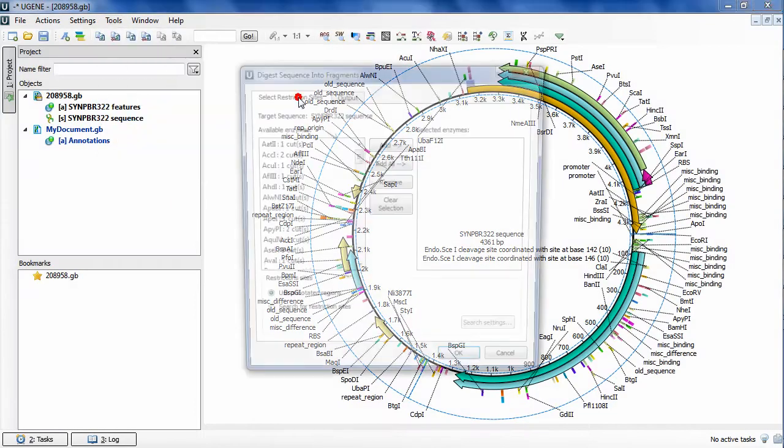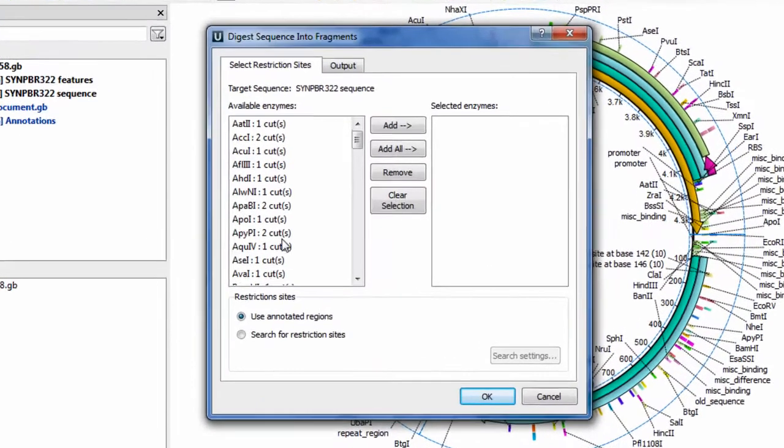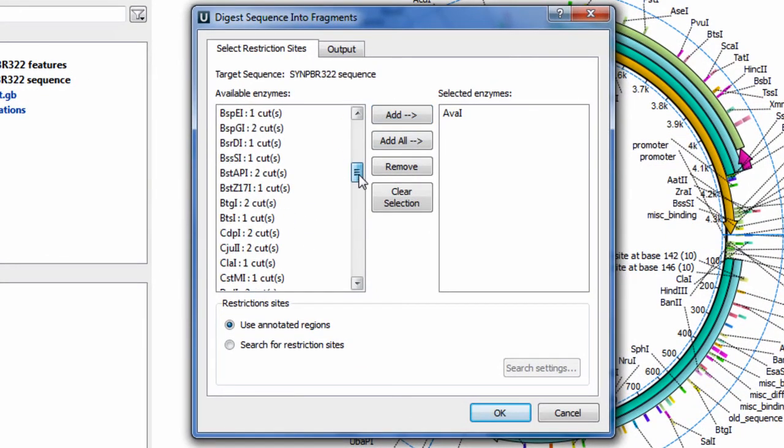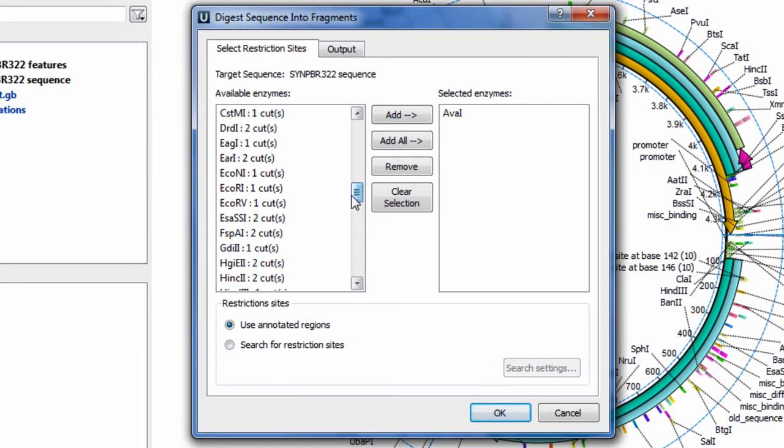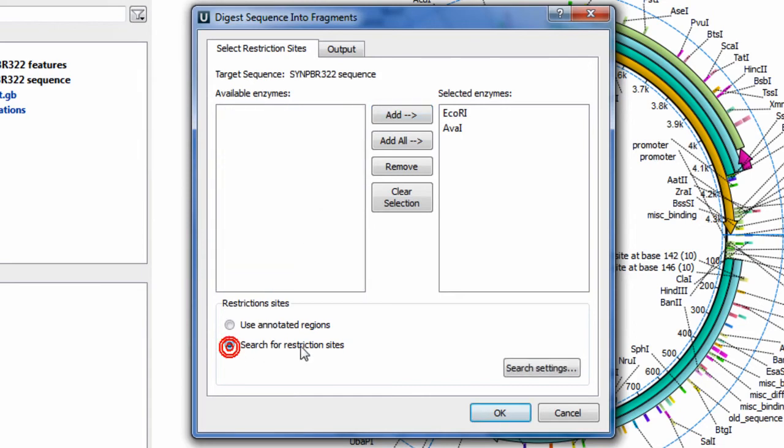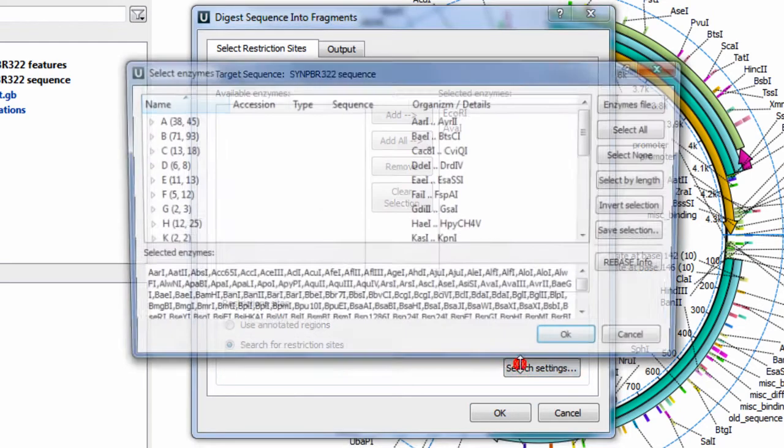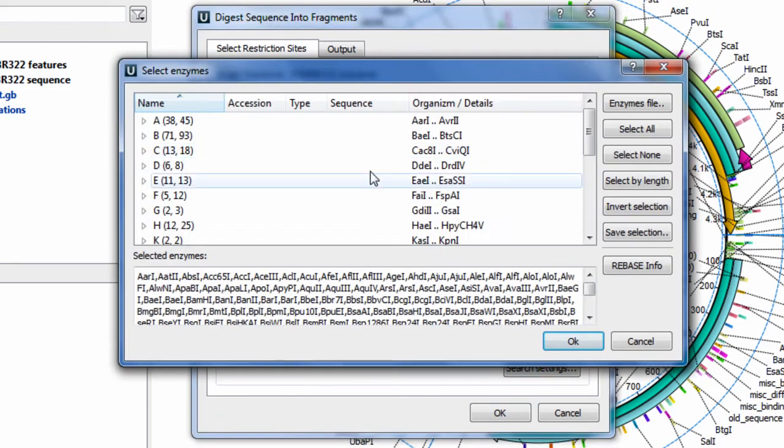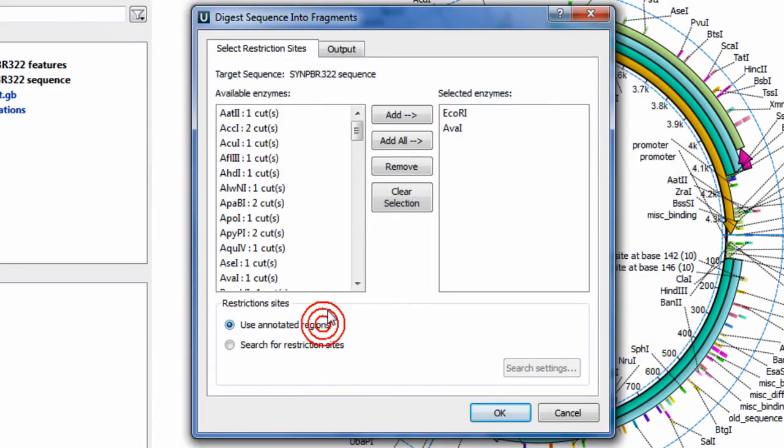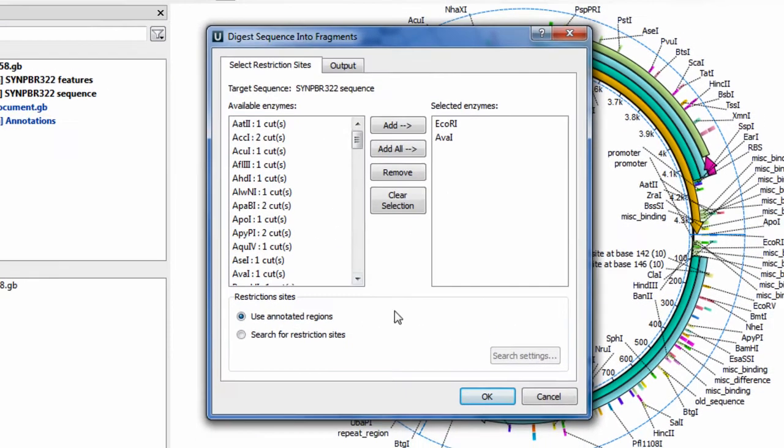The Digest into Fragments tool allows you to digest your sequence into fragments on the basis of restriction analysis results. Restriction site search settings are available from the same dialog. You can also use existing results of such a search.